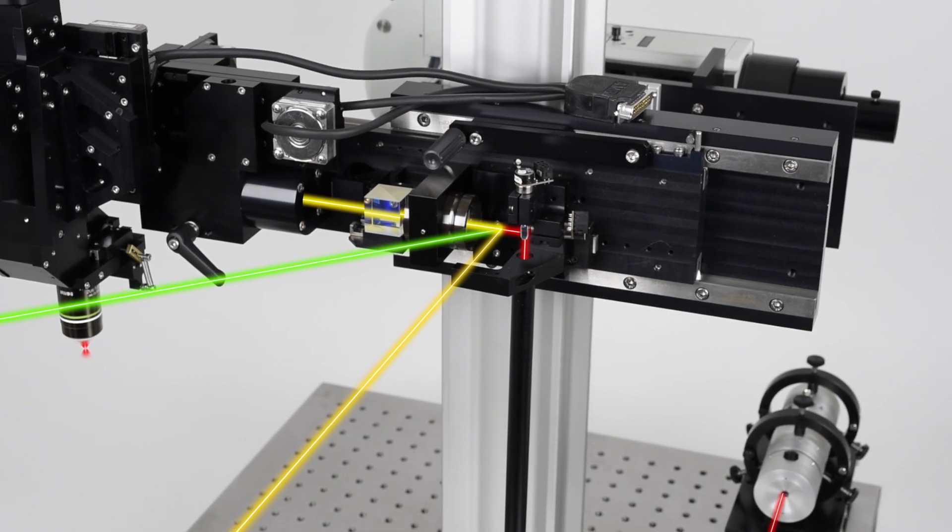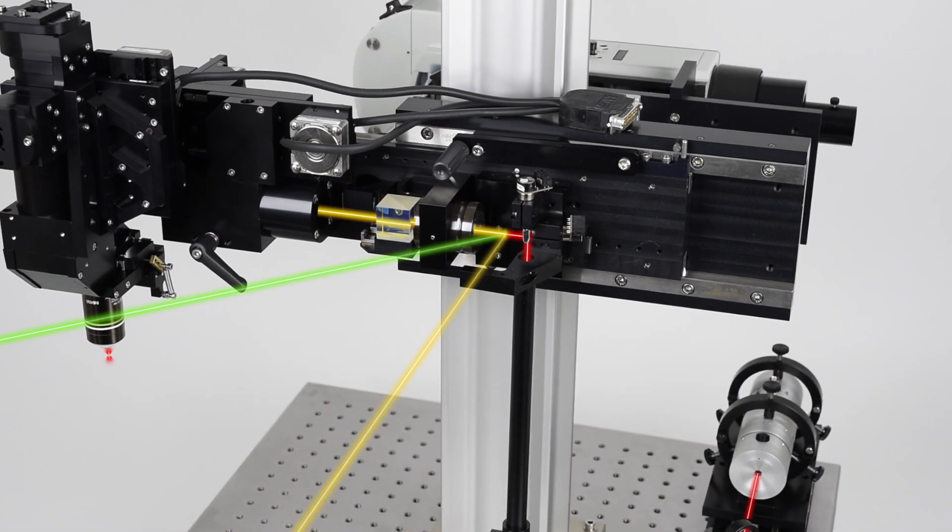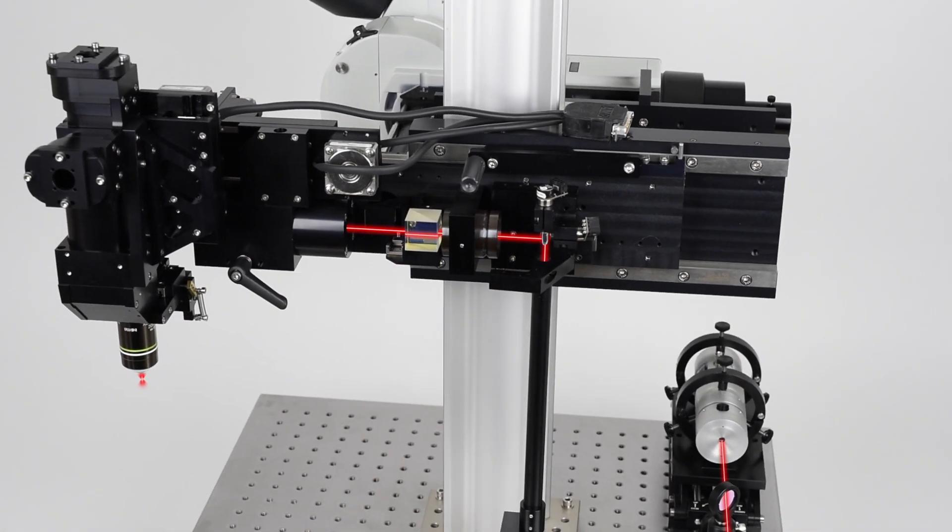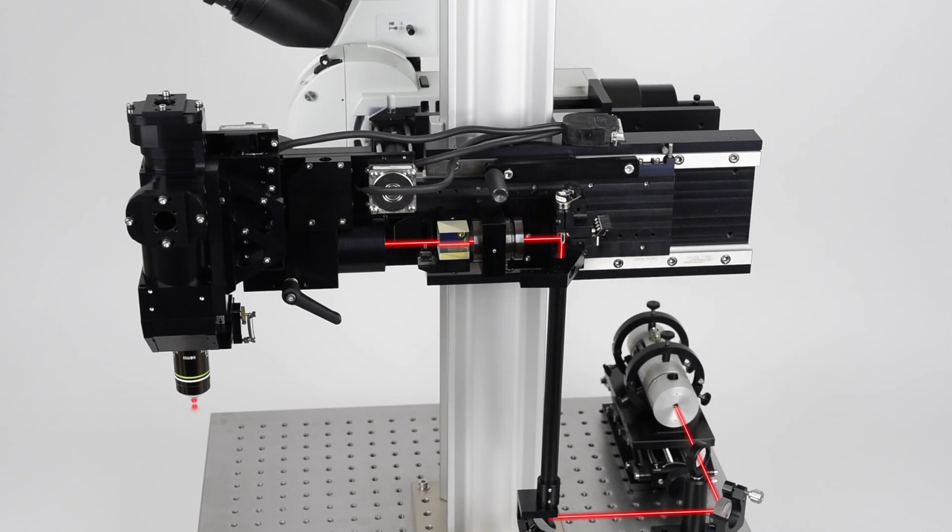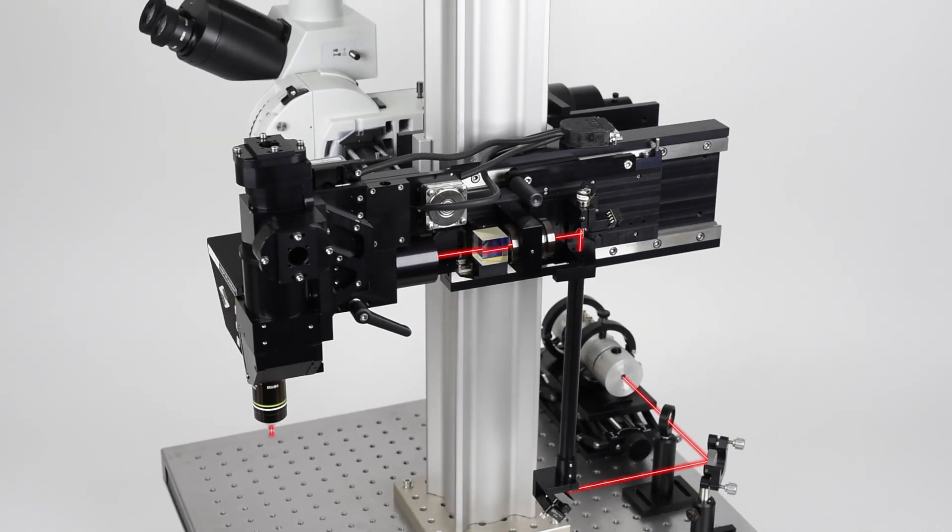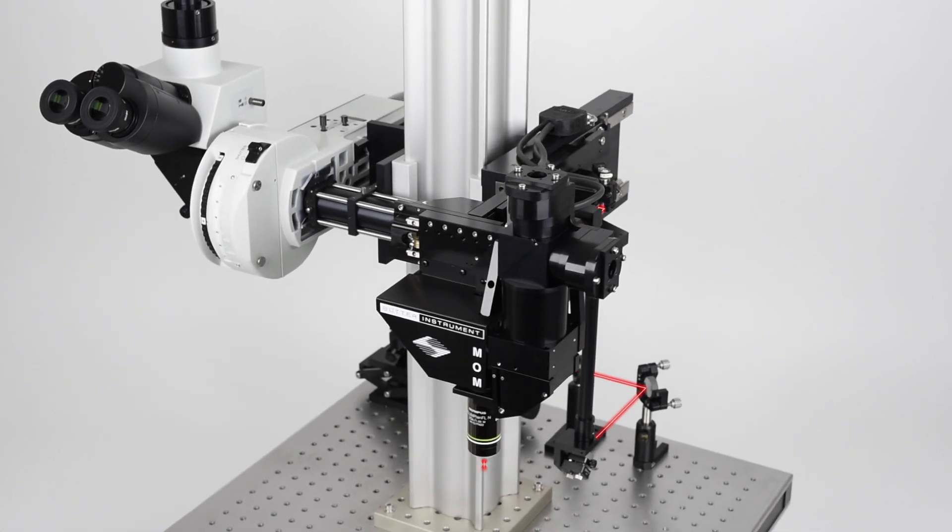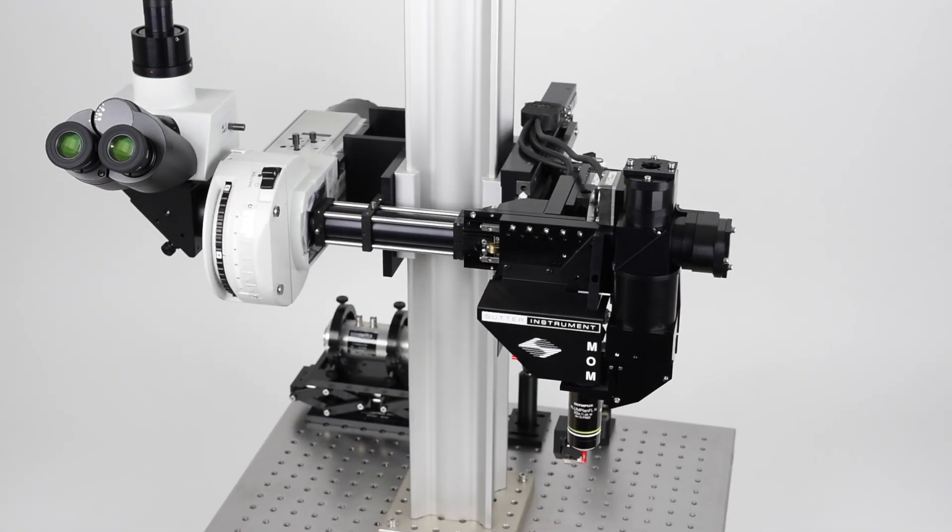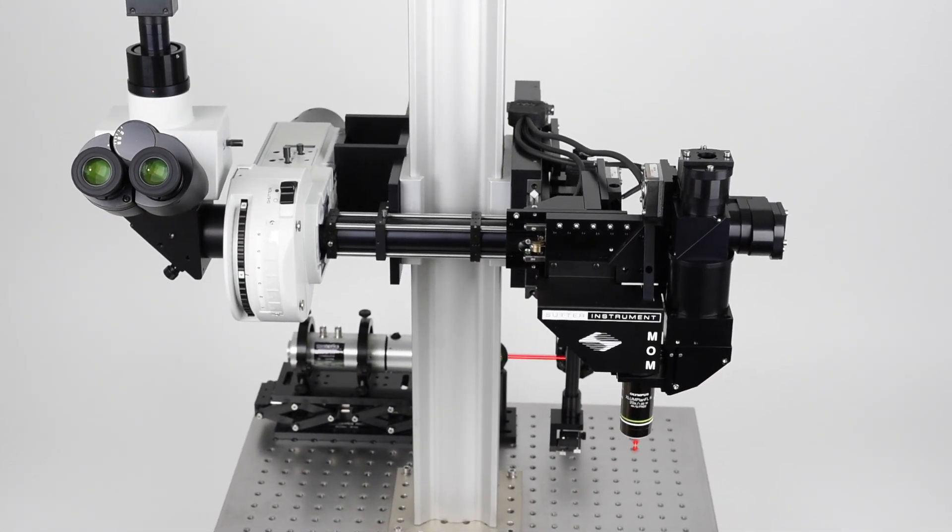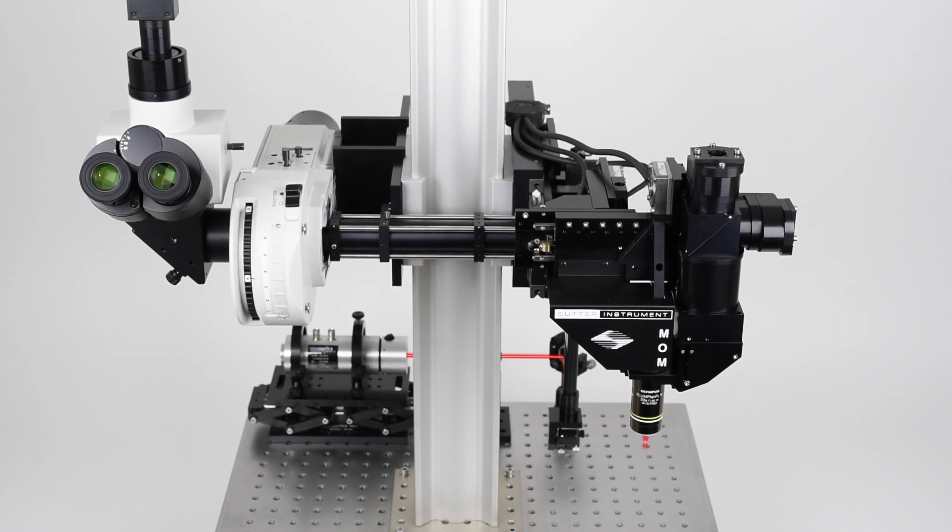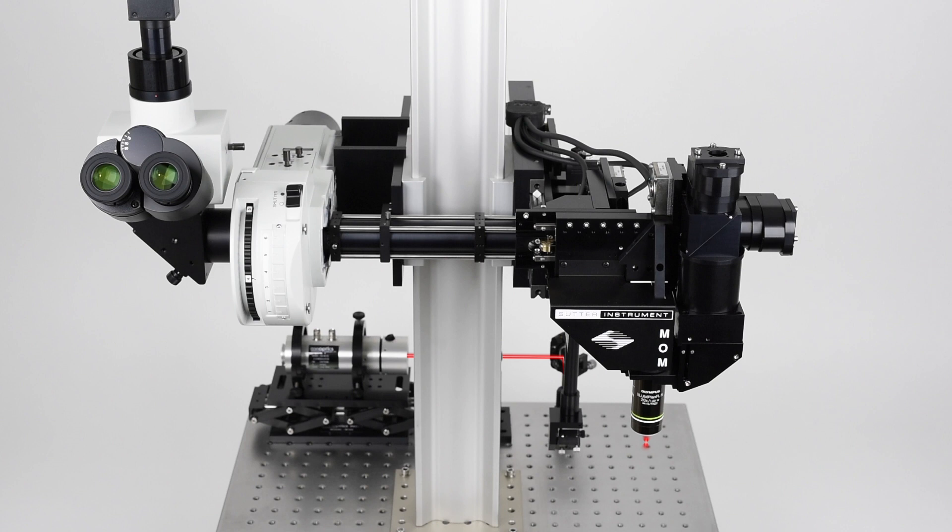Designed for flexibility, the movable objective microscope is easily modified. Will you need to stimulate many cells? Will you discover that you need to image deeper with three-photon imaging? Or will you develop and test a novel optical technique that has never been tried before? The many flexible beam path options on the Sutter Instrument Movable Objective Microscope make it the best open-platform multi-photon system to provide such downstream flexibility to match your dynamic research needs.